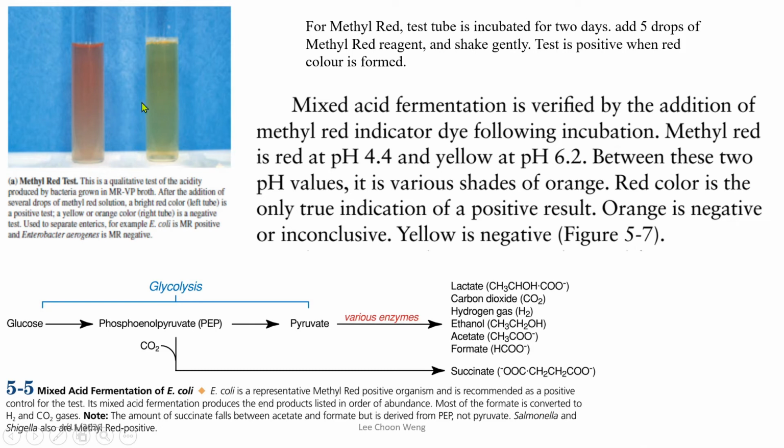For the Methyl Red test, after 2 days, we'll add 5 drops of the Methyl Red reagent, and if it is reddish, it is positive.